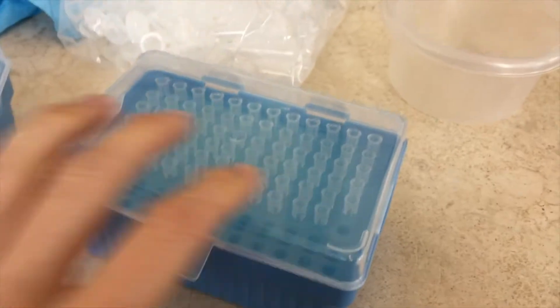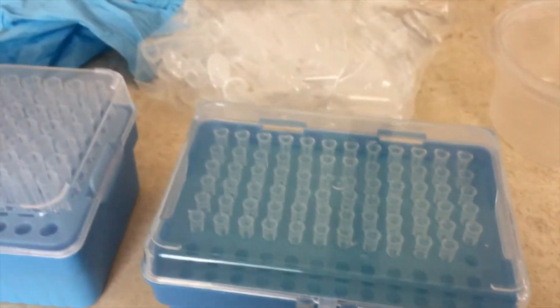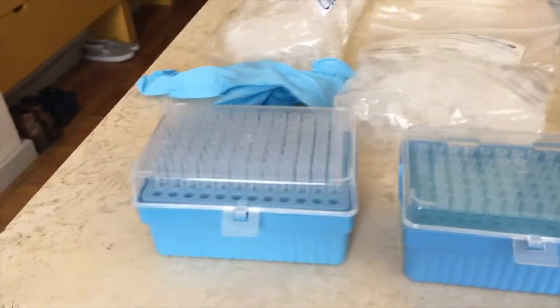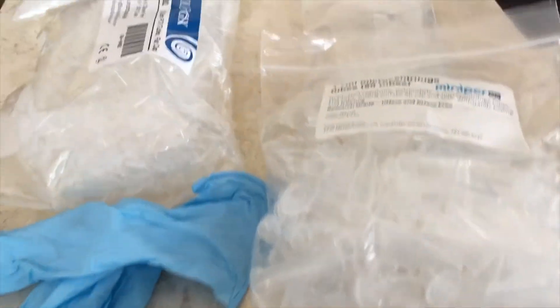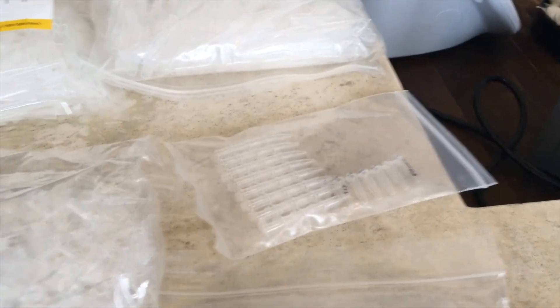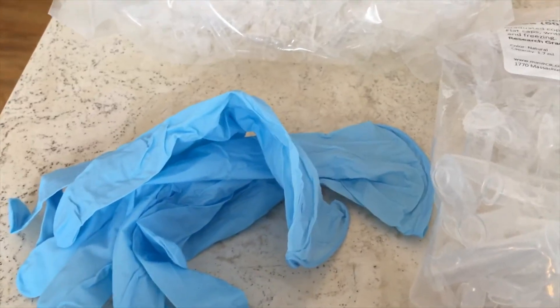Next, consumables. You're going to need pipette tips for the pipettes we just saw — some 10 microliter pipette tips and some 200 microliter pipette tips, which are slightly larger. I recommend you initially buy them in plastic boxes, but after you've used up a box it's a waste to buy them again — you can buy them loose on eBay in 1,000 packs, and as long as you wear gloves you can just put them in the empty boxes. You're going to need tubes: really tiny 0.2 milliliter tubes, which also come as strips, and 1.7 milliliter tubes. And you're also going to need gloves — for every single PCR process you're going to need a fresh pair of gloves.